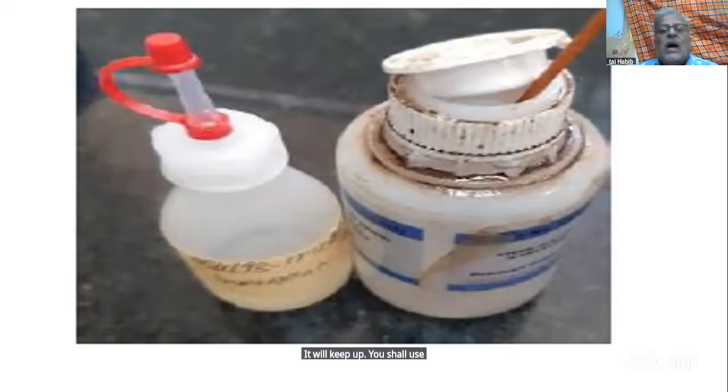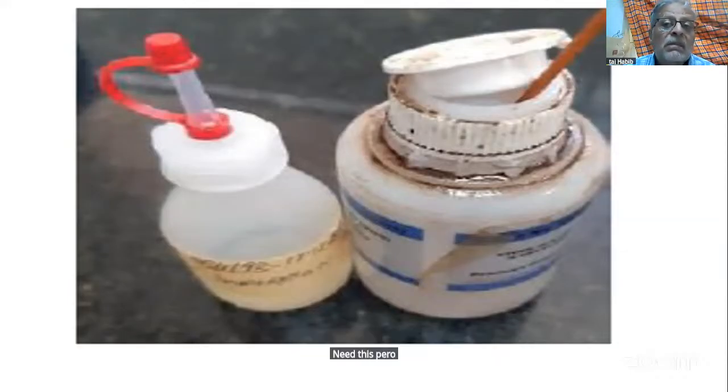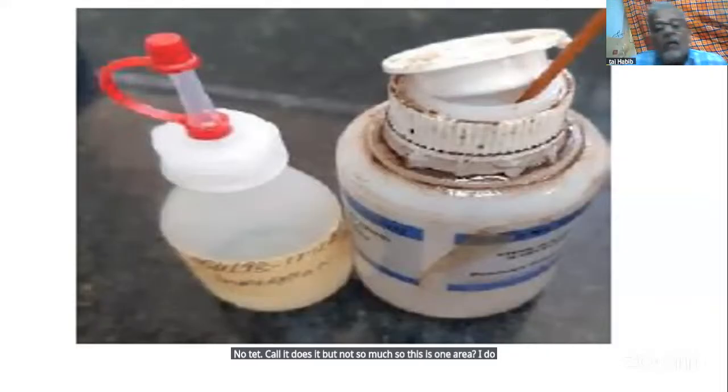If you are using a halogen lamp, you keep your spare bulbs. If you are using LED light, you don't need a spare bulb. They last maybe 5, 6 years, 7 years even, and it's a cold light. Not that cold, it does heat up, but not so much. So this is one area I didn't cover.